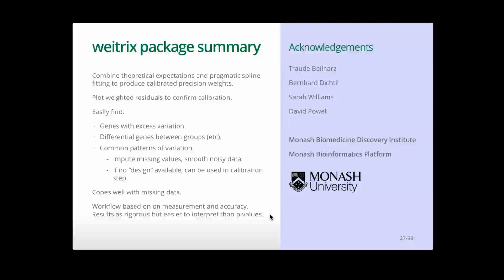Another general theme here is that it's a workflow based around measurement and confidence bounds. You don't need p-values to appear in your outputs anymore, but still keeping the same rigorous statistical theory underlying it all.